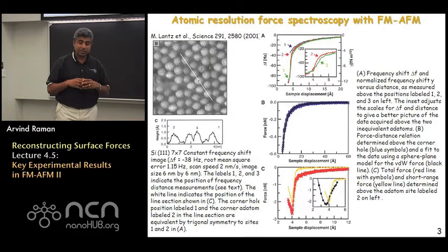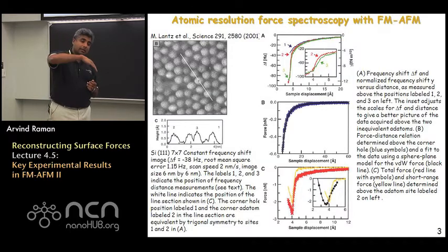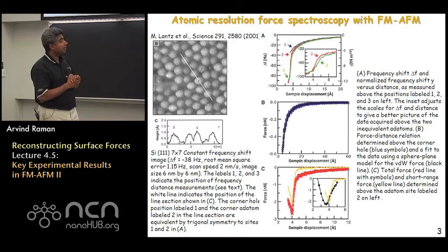They had a model for van der Waals interactions between the tip and the sample, and superposed over the experimental curve is a fit of the van der Waals model, and the fit was excellent, suggesting that van der Waals forces dominate the tip-sample interactions when the AFM tip is approaching the hole, which was expected according to the conditions that were investigated in this study.